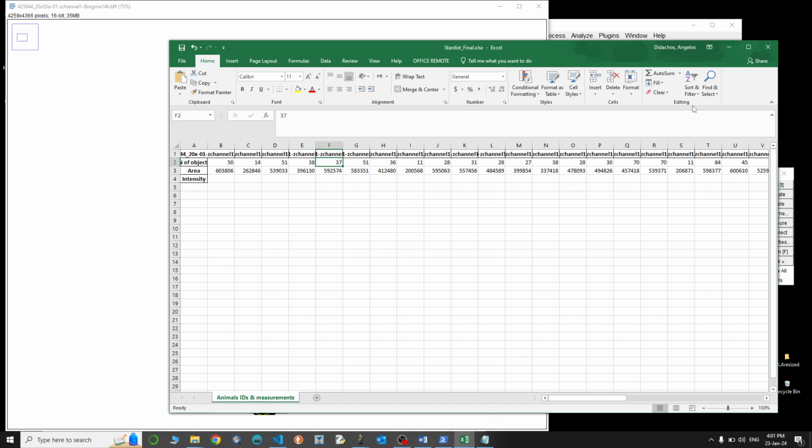And that was it. Congratulations. Now you should have your final ratios. And, well, fun starts at 22, but it gets crazy at 23, where we're going to look at colocalization. So I won't show you, but I'm also going to take the data for the BLA because this is my data for CFOS, and I have another data file for BLA. I will collect them both, and then I will see how well they colocalize.